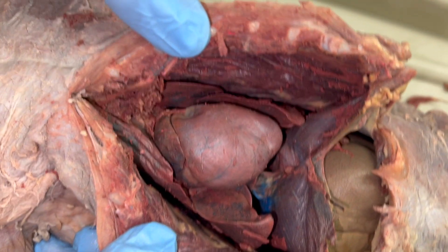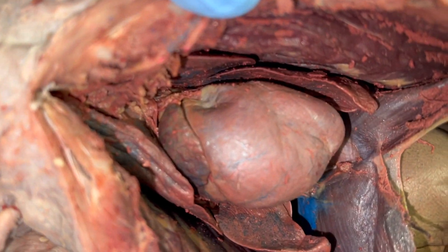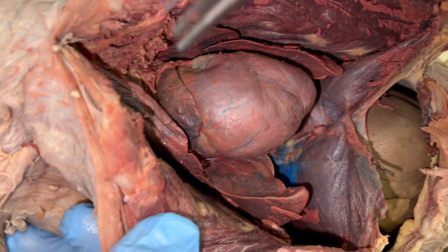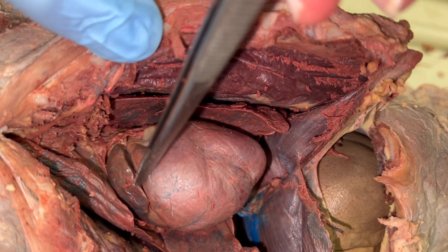You can see what it looks like now that the pericardium is removed from the heart. You should be able to see the top part of the heart. This is an auricle off of the heart — this kind of flappy part.